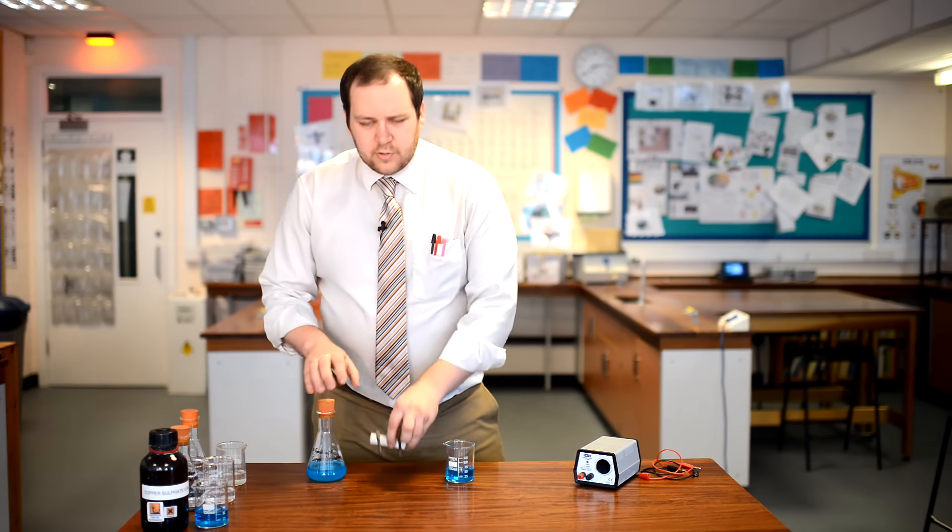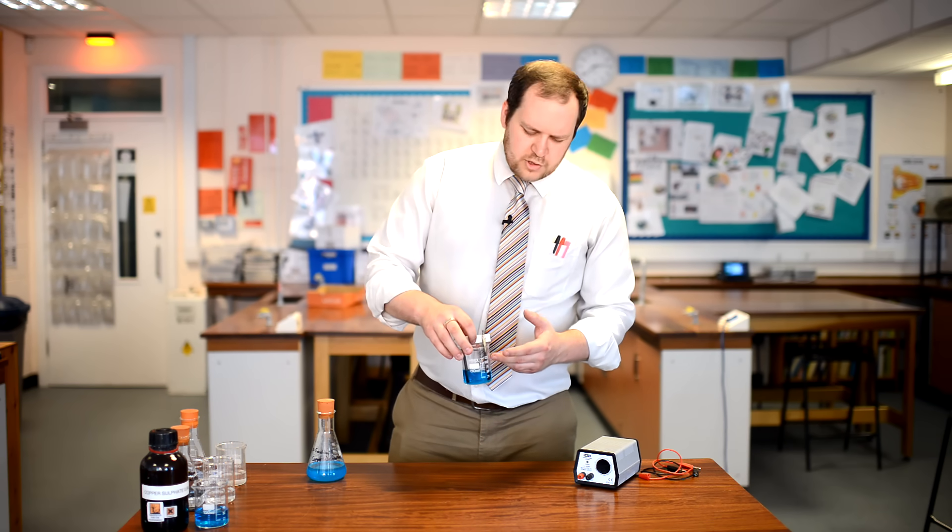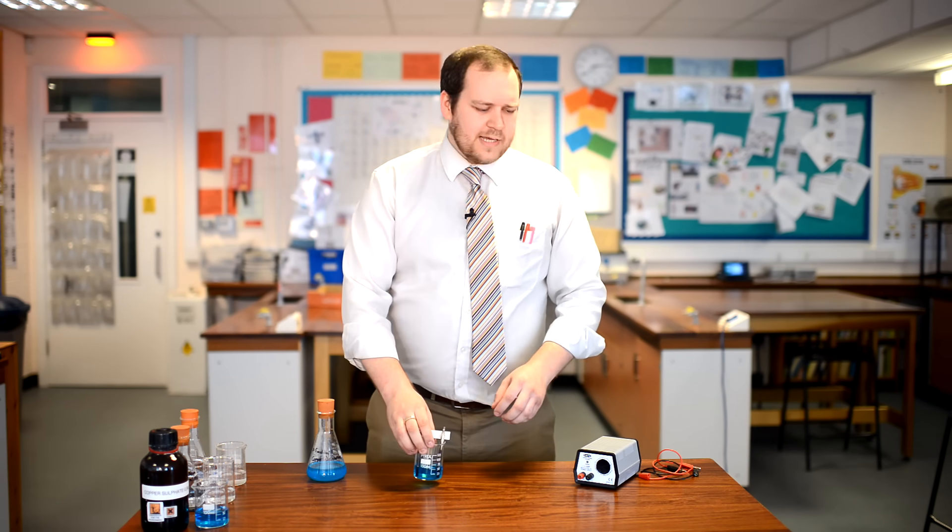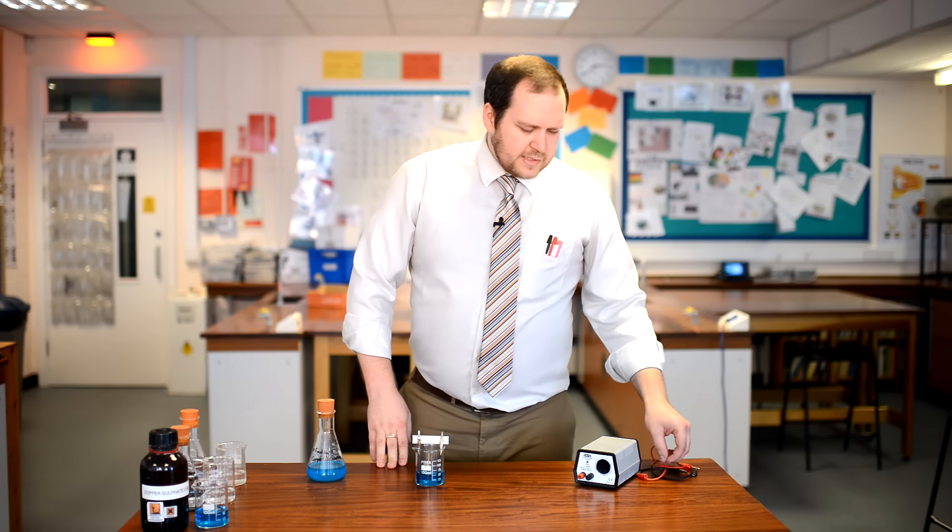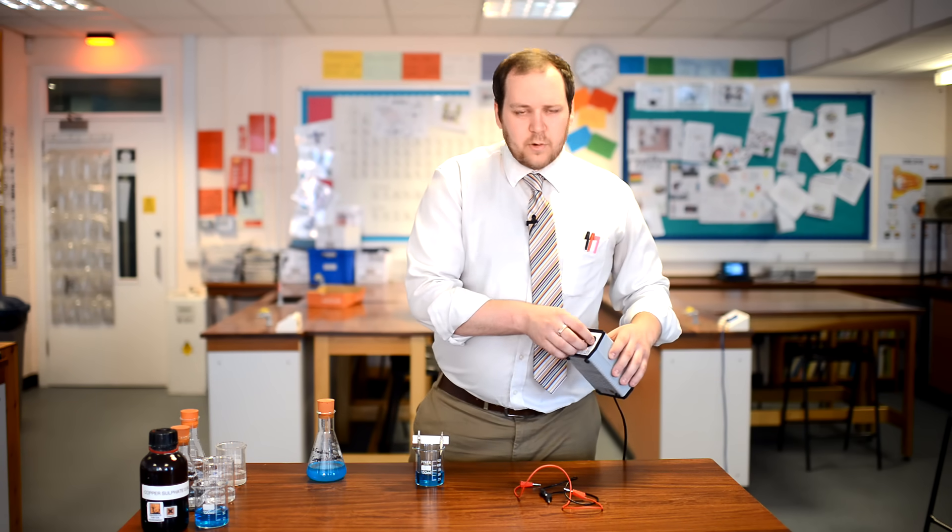Once that's in, you need to make sure that the electrodes are submerged inside the liquid but not too close to the crocodile clips. As you can see, there's plenty of room between the crocodile clips and the top of the liquid. The next thing we're going to do is collect up the power pack. Now we want to go with about 4 volts for this practical.